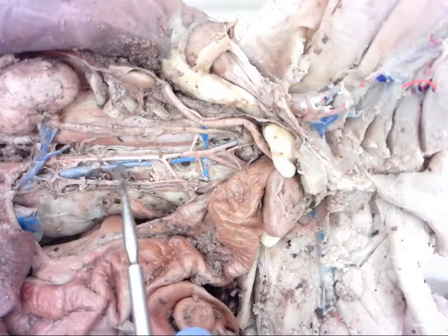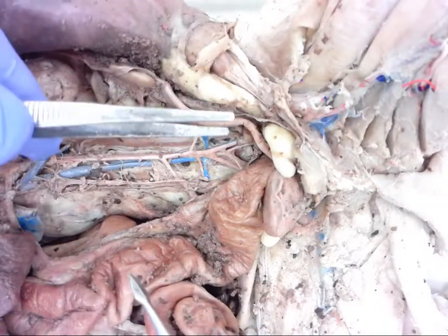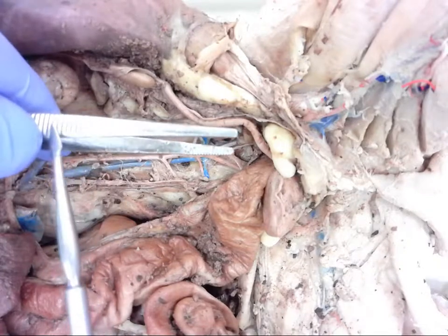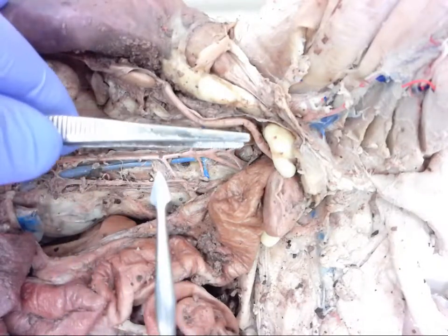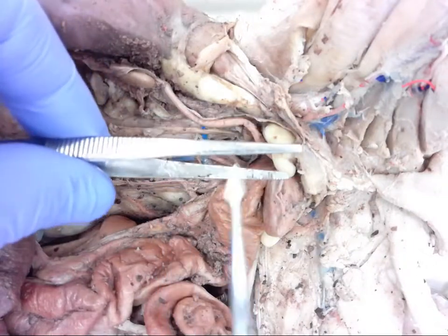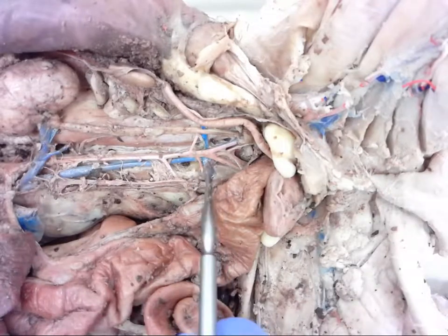And then as you get further down, they sort of rotate on top of each other. I'll use my forceps as an example here: you have the inferior vena cava on top, and then as they go through the abdominal area, they're going to rotate, and your aorta is going to be on top, as you see right here. Okay, this is going to come back up.